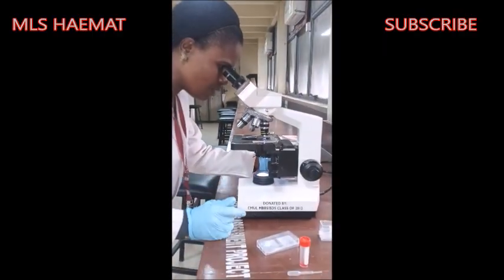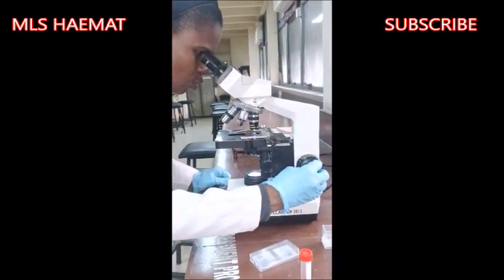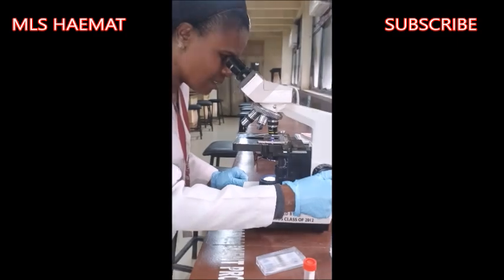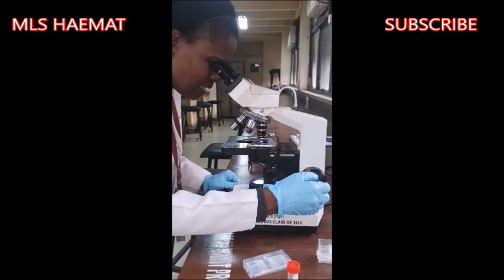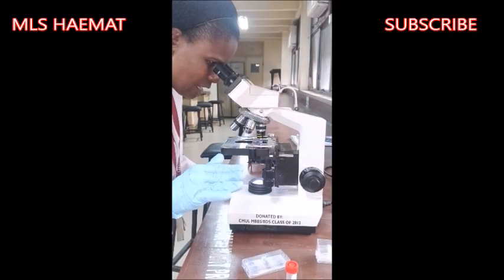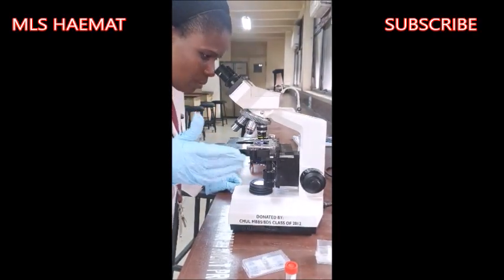Once you change it to the ×10 objective lens, all you need to do is just touch your fine adjustment, just briefly. You can see, I've already focused with the ×10 objective. I'm already seeing the cells under the microscope.